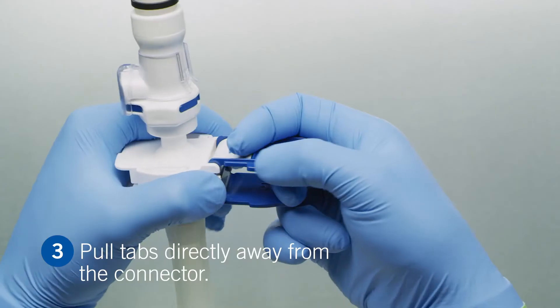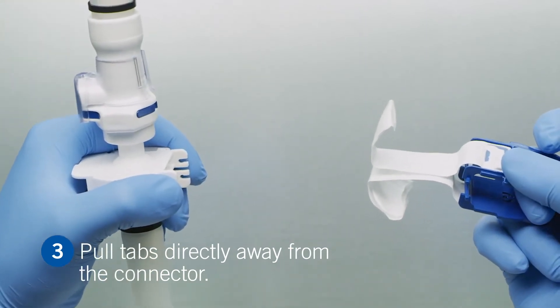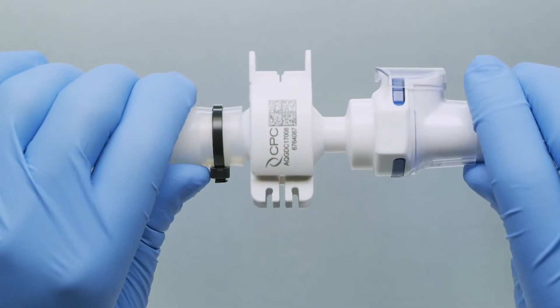To complete the assembly, insert a finger into the pull tabs and remove the membranes by pulling the tabs directly away from the connector. You are now ready for sterile fluid transfer.